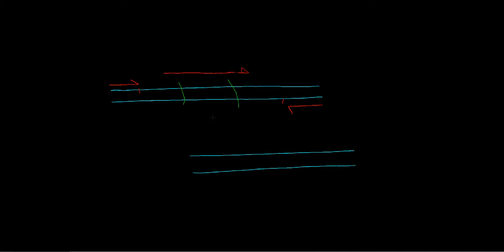and I should annotate this before I move on. That forward primer is going to give us our little green area. Again, I'm just bad with scale today. I'm going to step back even further. So that forward primer is going to give us our right-hand chunk. And let's get that all annotated up.